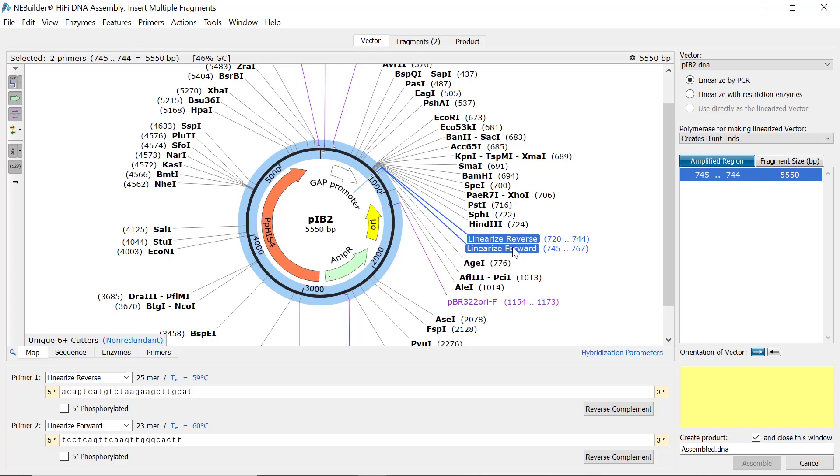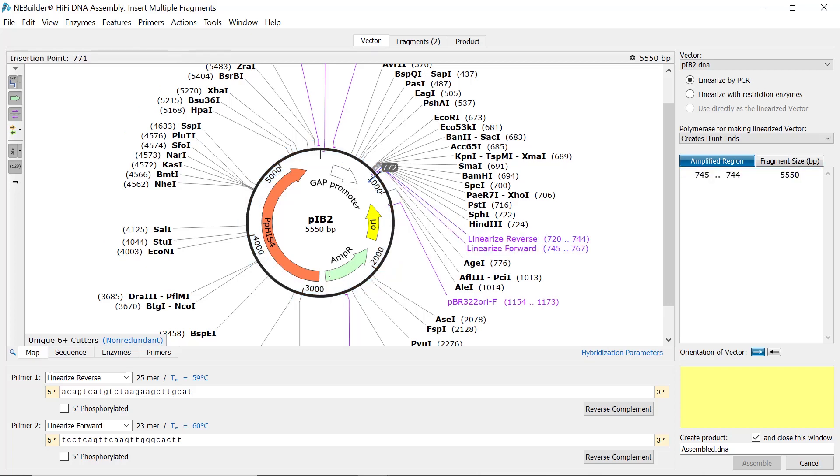If appropriate primers are not present on the vector, SnapGene can design primers for you. Simply select the vector region to be amplified, or click within the sequence to define the point of linearization by PCR.